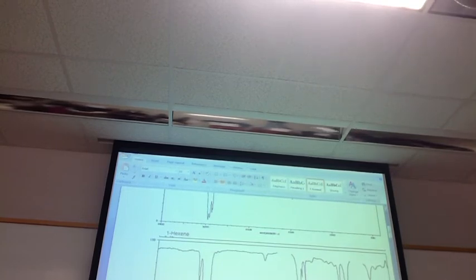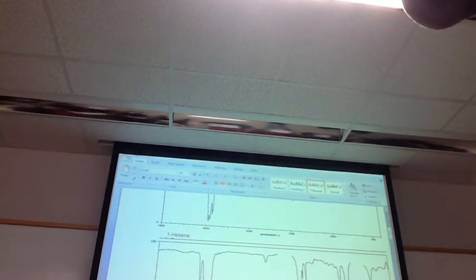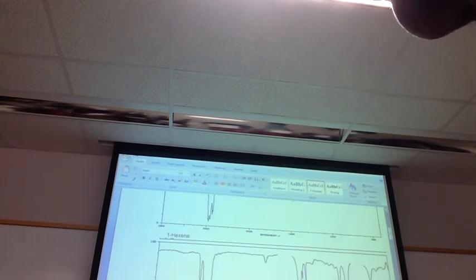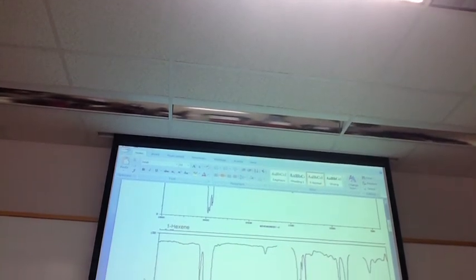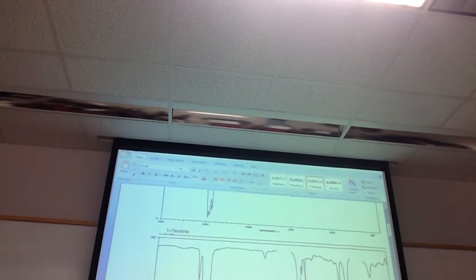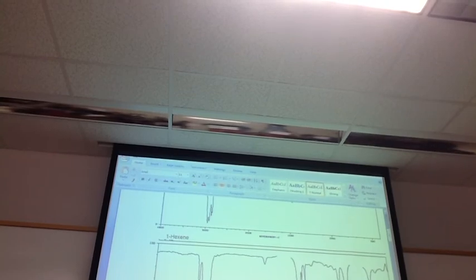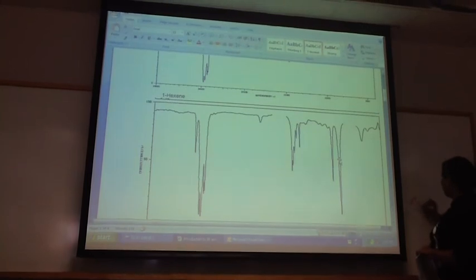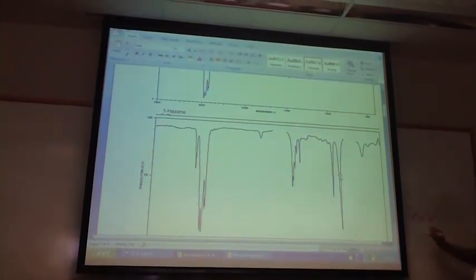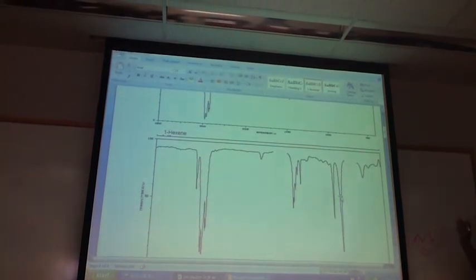Does my hexene also have alkane peaks? If so, why? I have an alkene, so I have hexene at the bottom. You still got the alkane in the middle. One hexene looks like this. This part of the molecule is the alkene. All of this is still alkane. So you should expect to see those.